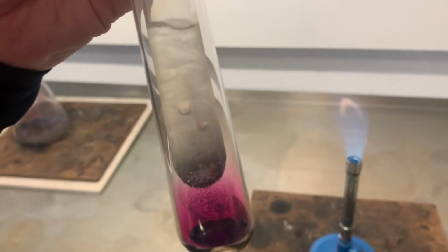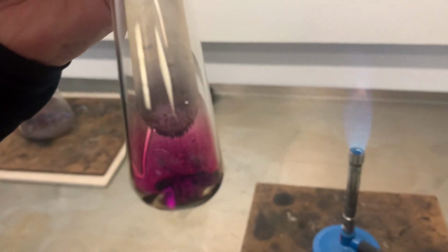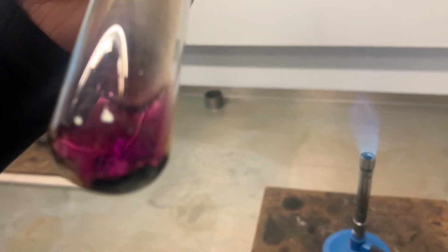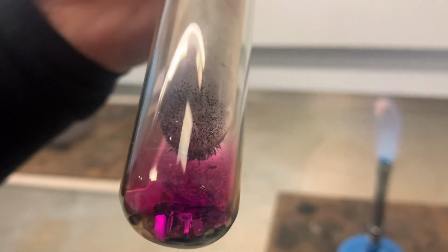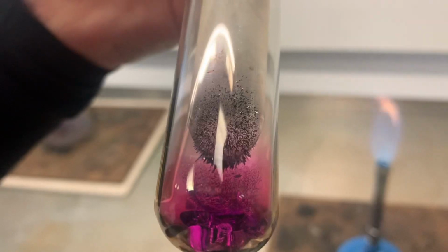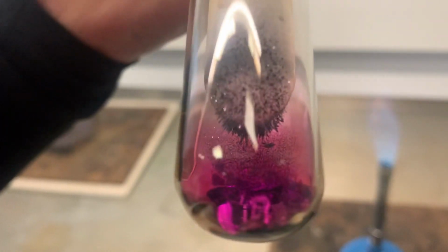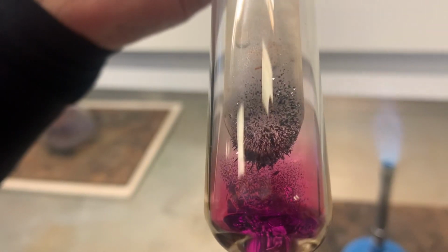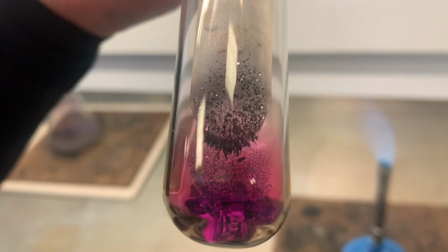If not, when you're back in the lab, you can see them glittering a wee bit in the light. Hopefully your teacher will be able to show you this. In real life, it looks pretty cool. Well, there you go, that's showing up now in the video. So you can see the grey solid at the bottom, the purple vapour, and then the grey crystals forming on the surface of the test tube. It's just the reflection of the lights in the classroom that's hitting off the test tube at the minute.